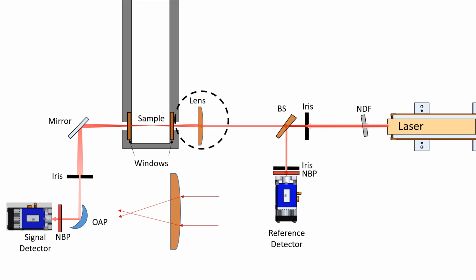The plano-convex lens focuses the incoming collimated beam. The beam waist should be at the center of the sample, so the lens should have a focal length that allows this placement. After the waist, the beam will begin to diverge again. Here, I accept a loss of some of the light due to this divergence and use the off-axis parabolic mirror to recollimate the light just before directing it into the signal detector.